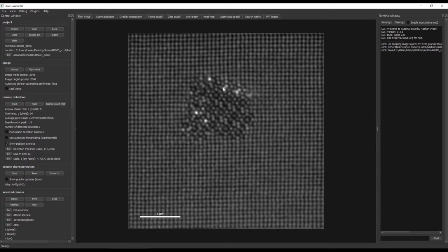This image has copper, which has very bright contrast. This will shift the contrast of the other columns down relatively. And let's say you had a pure beta double prime with no copper, then all the columns would be brighter. So for this one with copper, or a bright column, we want somewhere between 0.2 and 0.25, and for non-copper images maybe you can guess something like 0.3.